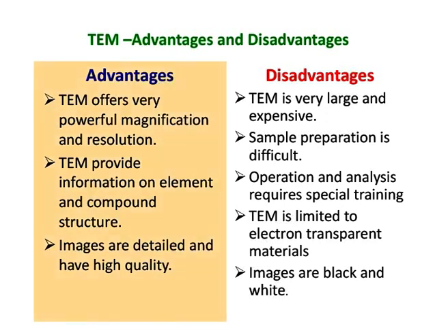The advantages include the fact that TEM offers very powerful magnification and resolution. It provides information on elemental and compound structure. Images are detailed and have high quality.